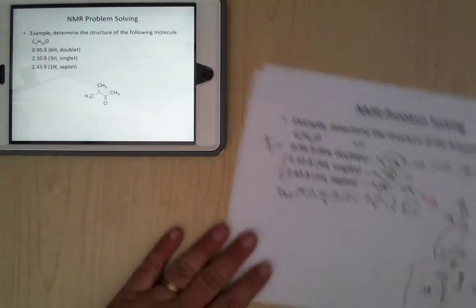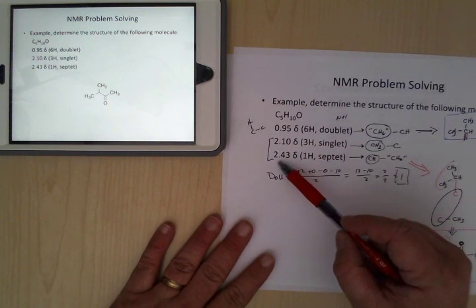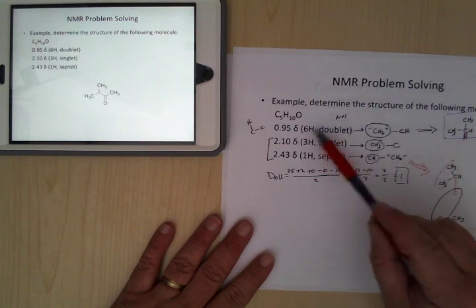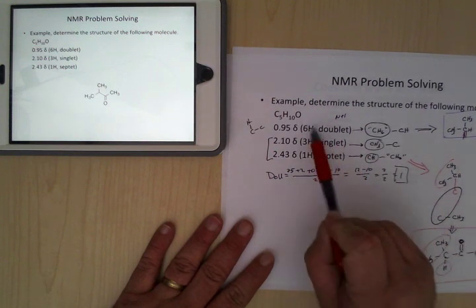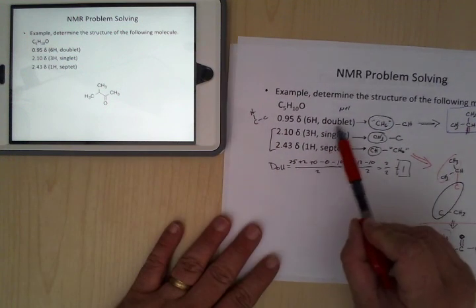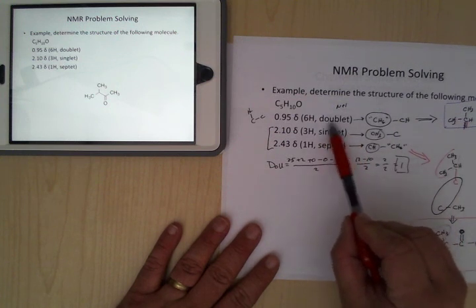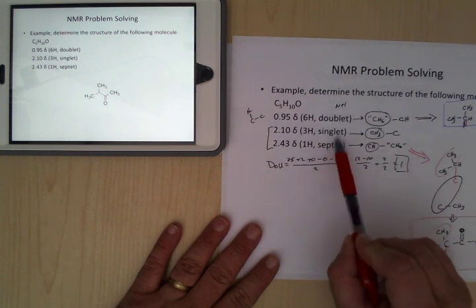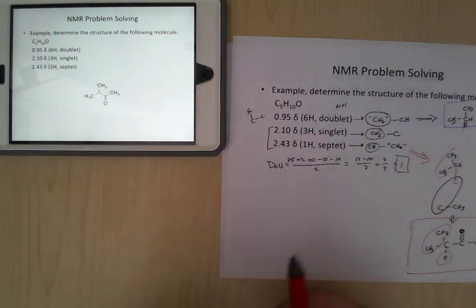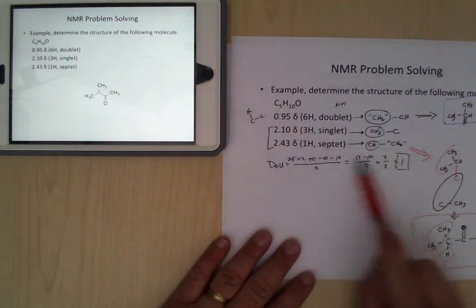So we talk about doing the DOU, and seeing what the chemical shift information is telling you. Can it tell you anything? What do the integrations tell you? What does the splitting tell you? This will tell you how many hydrogens are on that carbon typically, except for that one we did before. But what did the neighbors look like? From all of that, you should be able to put everything together. And there's only going to be one solution that makes sense with all of this information.